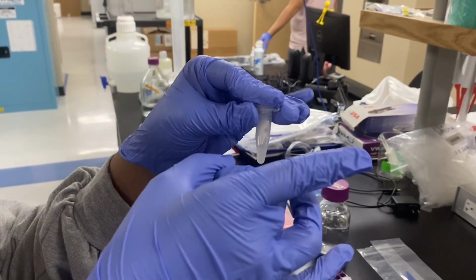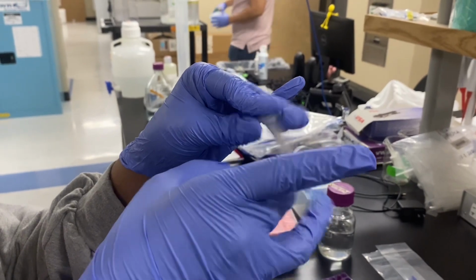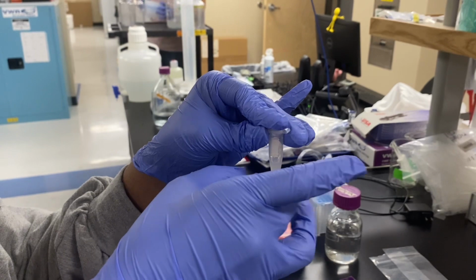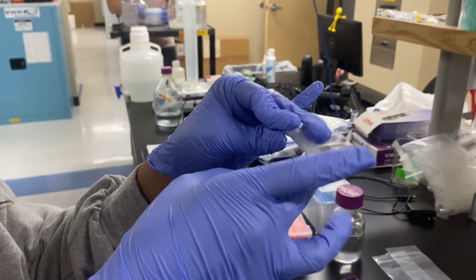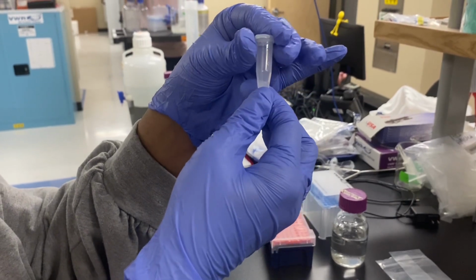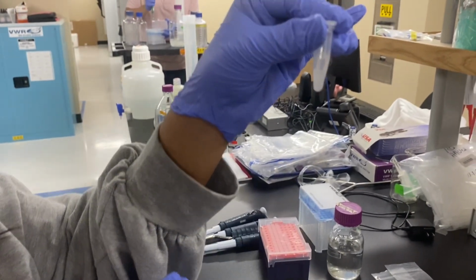If you do not have a vortex available, that's no problem. Simply flick your tube until you begin to see a cloudy appearance and the cells are dissolved. You may use this flicking method in place of each vortexing step in the protocol. Keep in mind, you may have to flick many times in order to dissolve the cells fully.